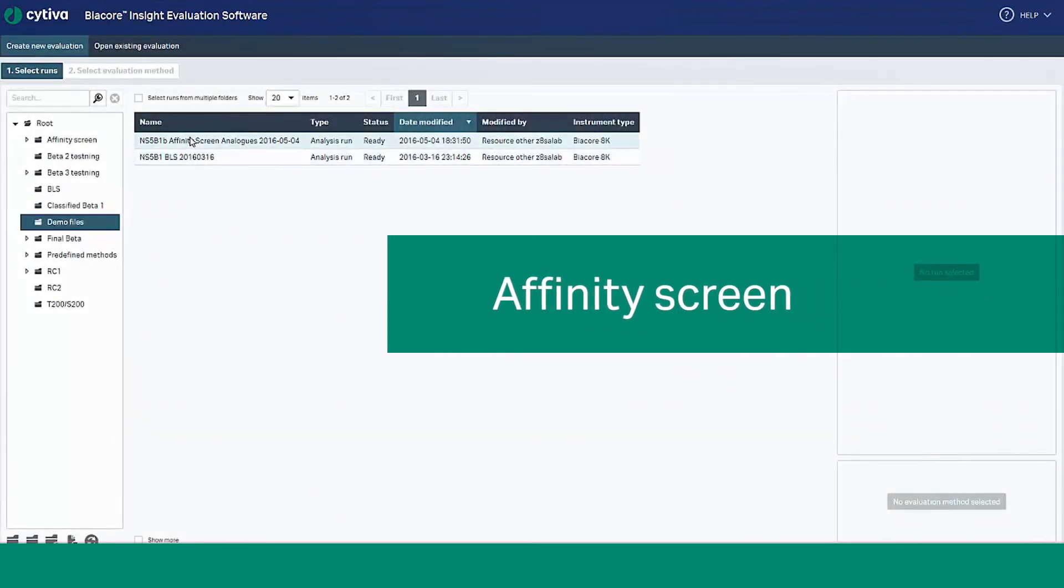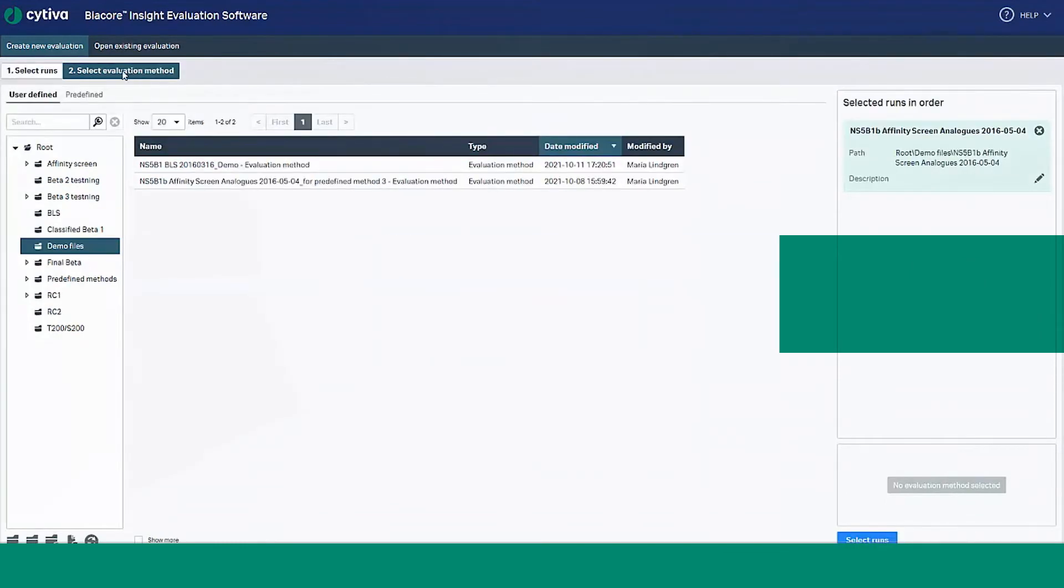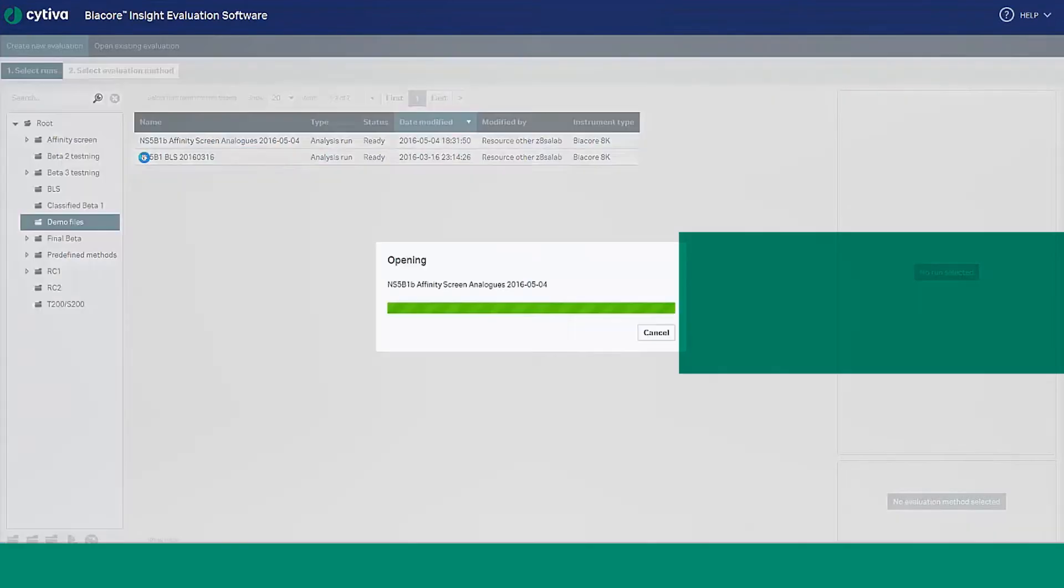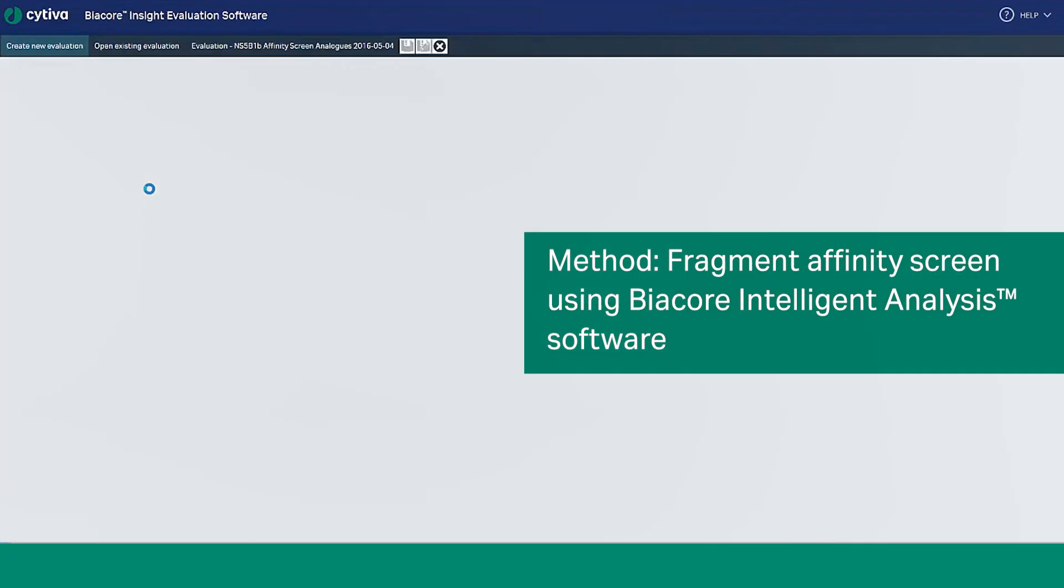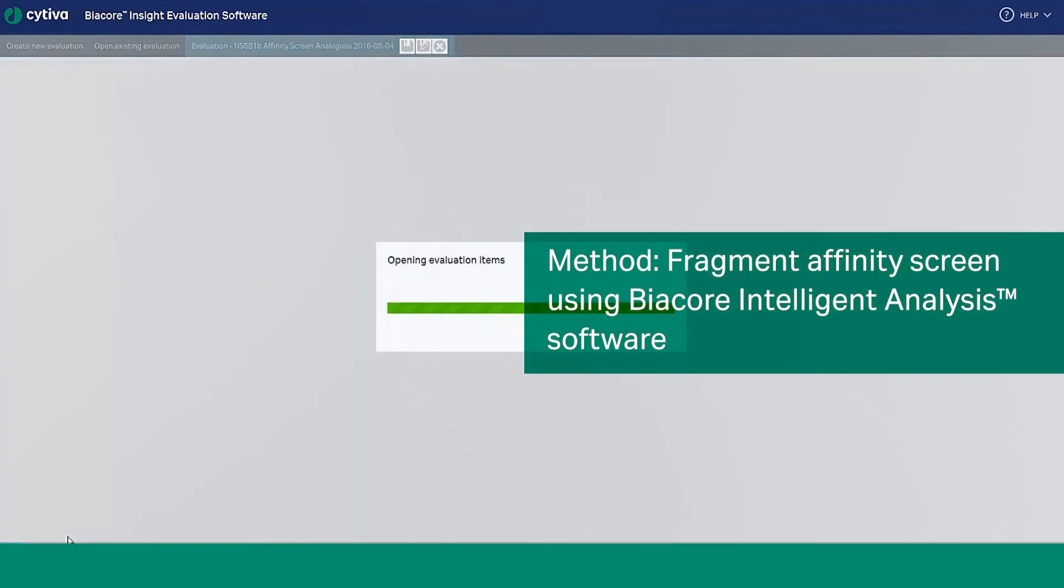Let's move on to the affinity screen functionality. This tool verifies target engagement and automatically provides an estimate of steady state affinities. Here we have opened an affinity screening data set and applied the evaluation method, a fragment affinity screen using Biocore Intelligent Analysis.